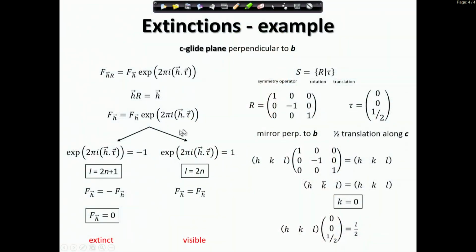I know that this may sound complicated, but actually if you study it, you realize that to derive any systematic absence of any symmetry element in any space group, the only thing you need to know are these two equations. That's all. And you can derive everything. That's, I think, quite elegant. All these International Tables, or a very large part of that, not all, but a very large part of that, is contained in these two equations and some background knowledge.